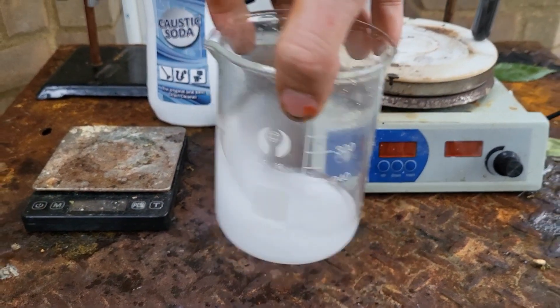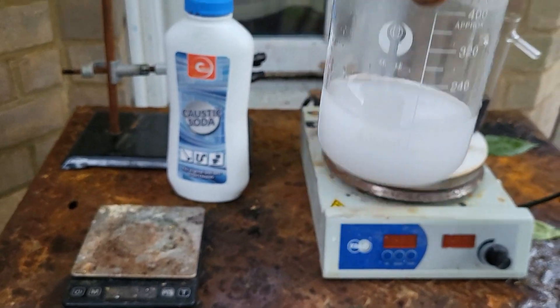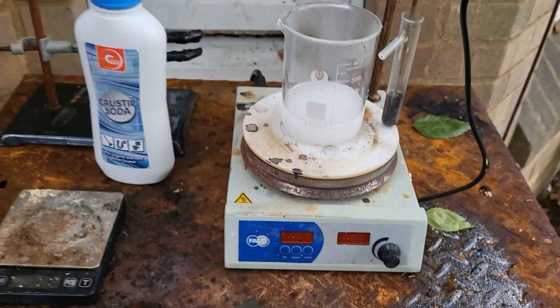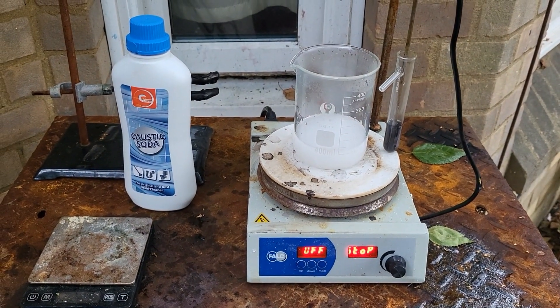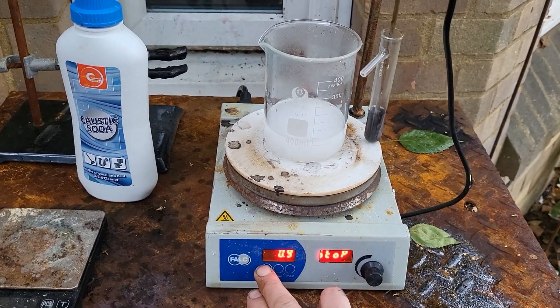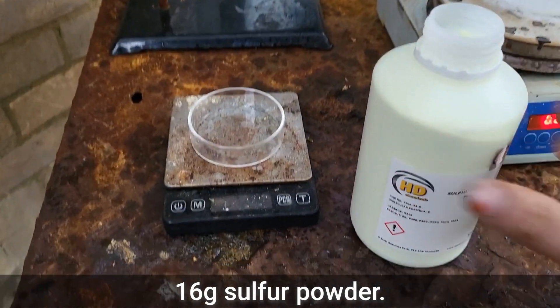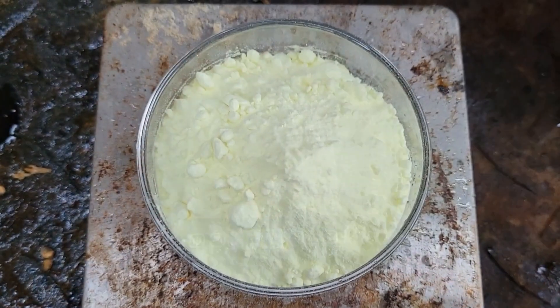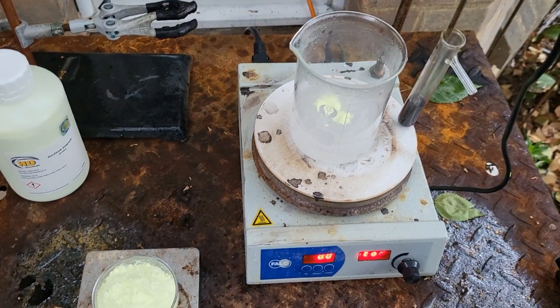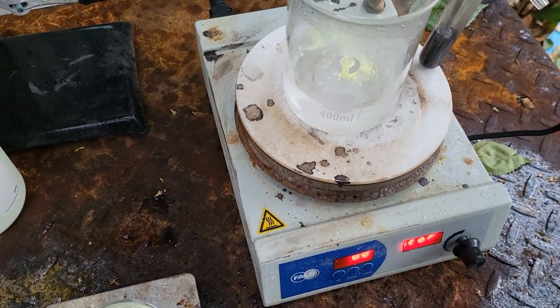Water to dissolve it, put this on the hot plate, lift that to 100 degrees. We have 16 grams of sulfur powder — 16 grams — and start adding the sulfur to it with stirring.